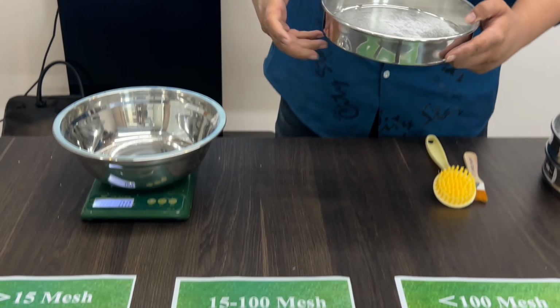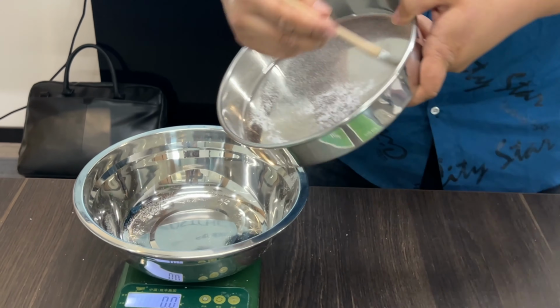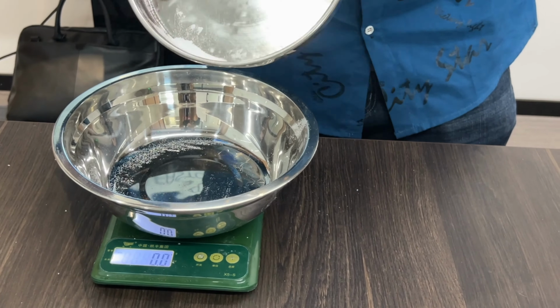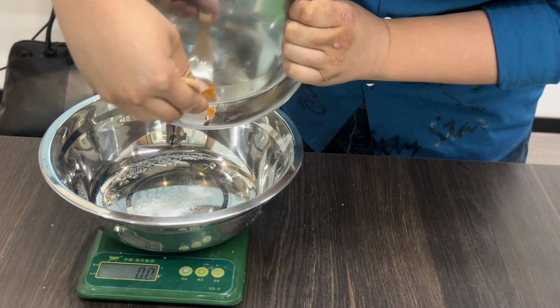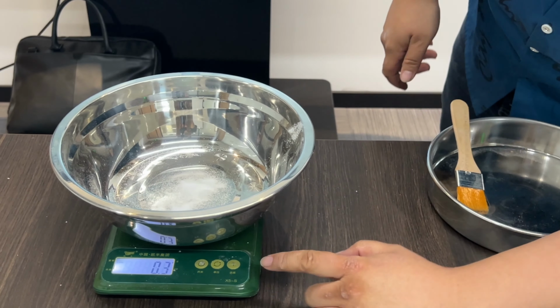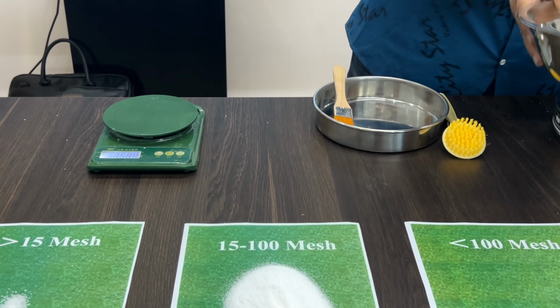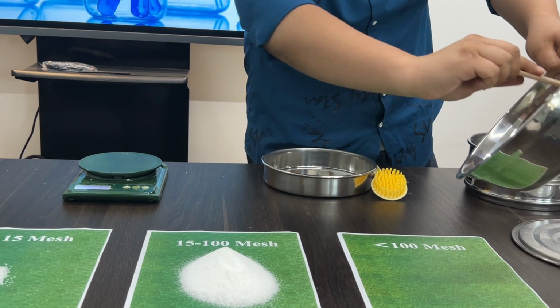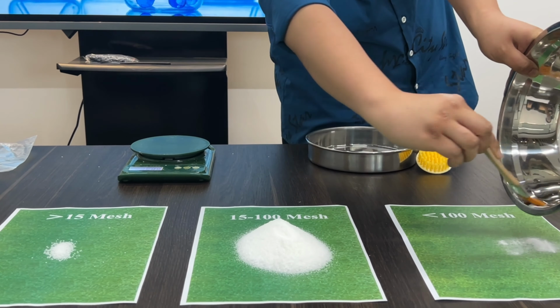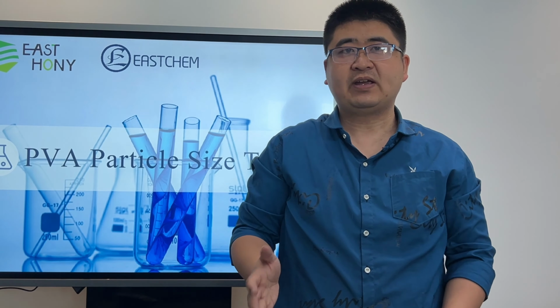And the bottom bowl is a fine powder. You can read it is 0.3 grams. So this is the 100 grams PVA sample.